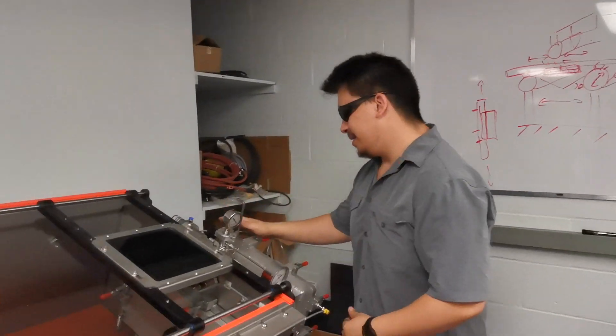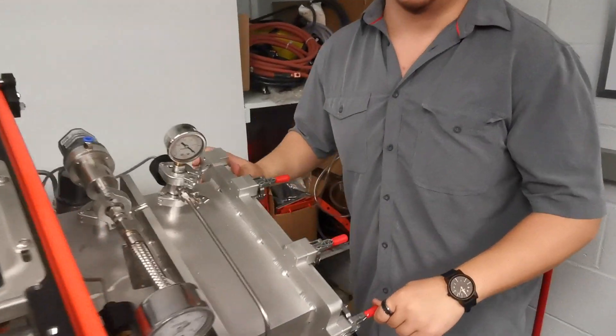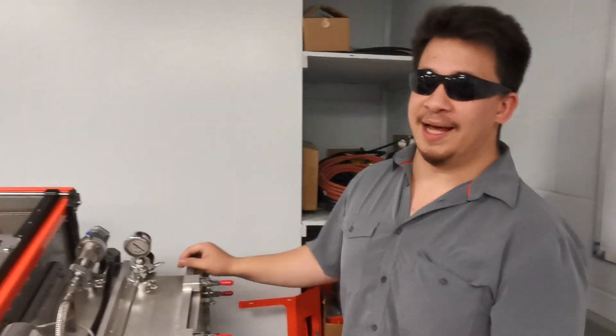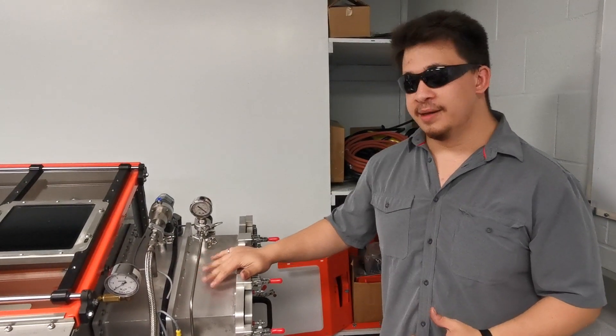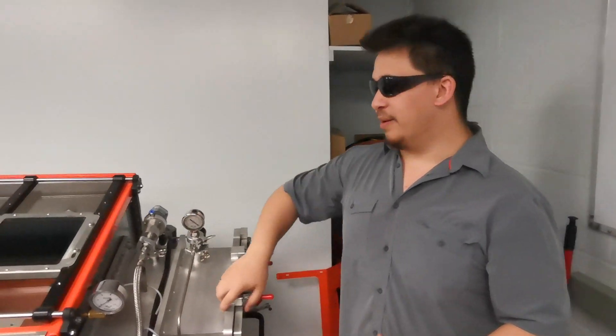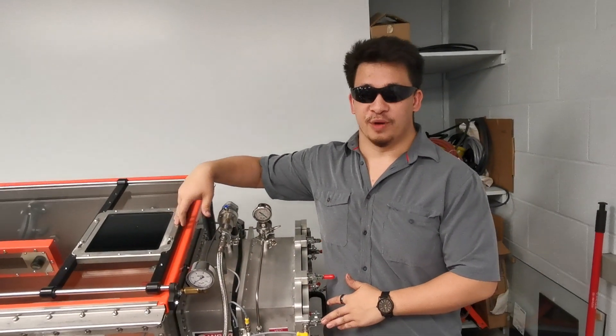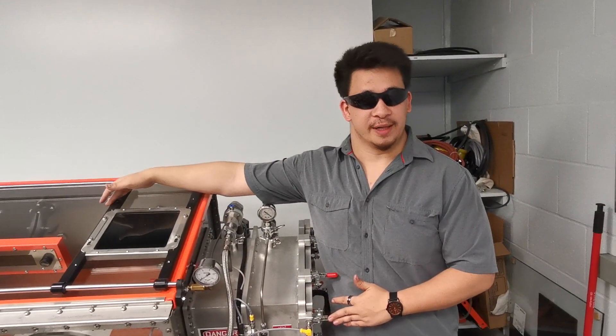On this side, this is our premium option which is a vacuum controlled anti-chamber, allows you to very rapidly reduce the oxygen level here. So we pull out all of the air, then we purge it with argon, and then we allow you to open the inner door in order to get your parts in and out very quickly.